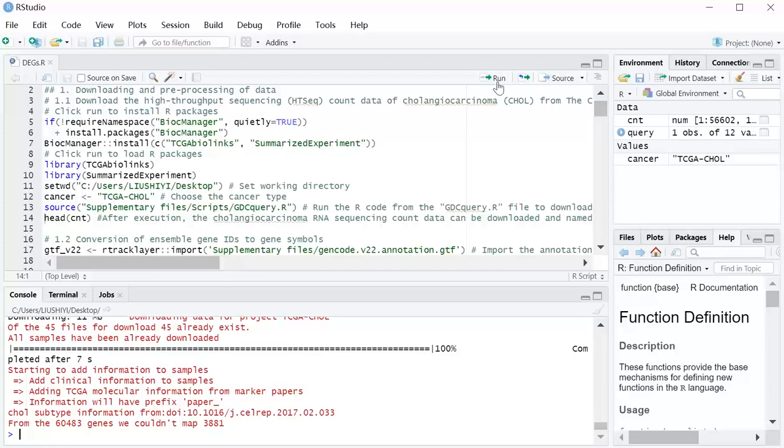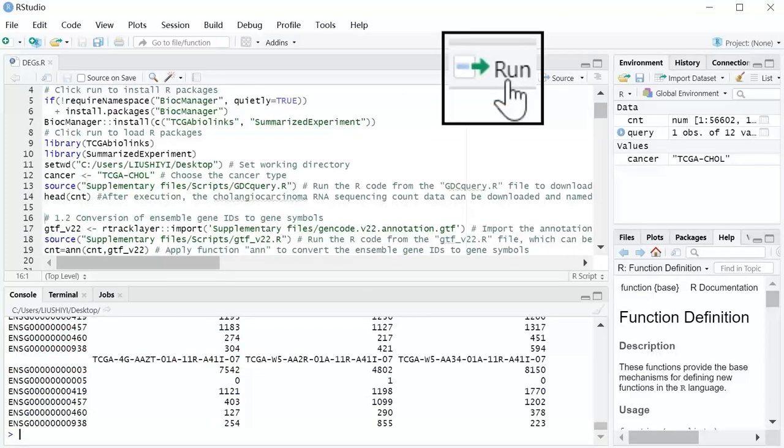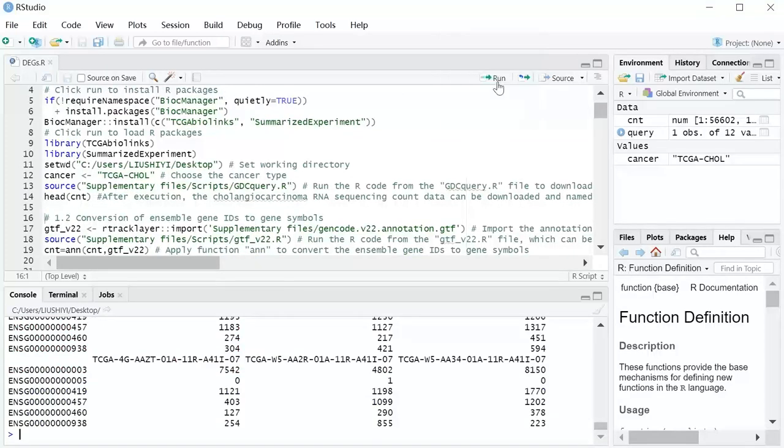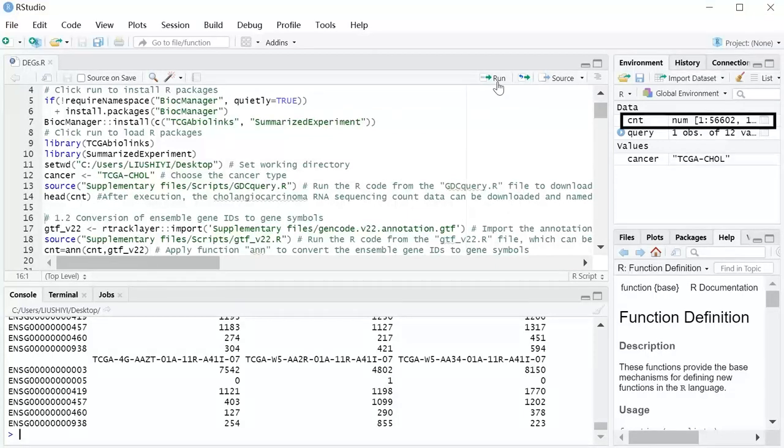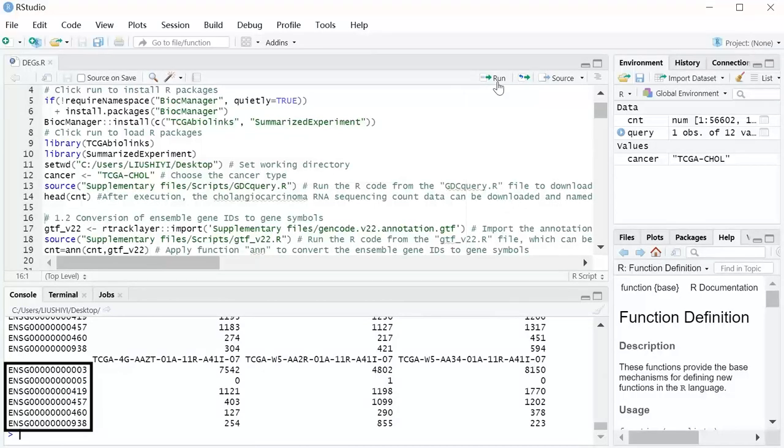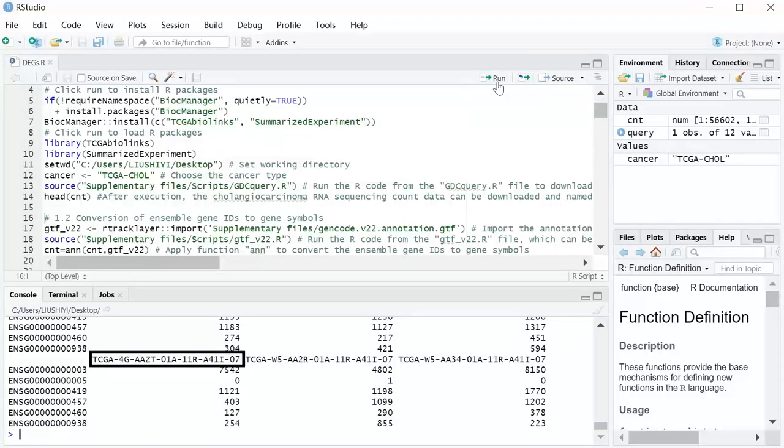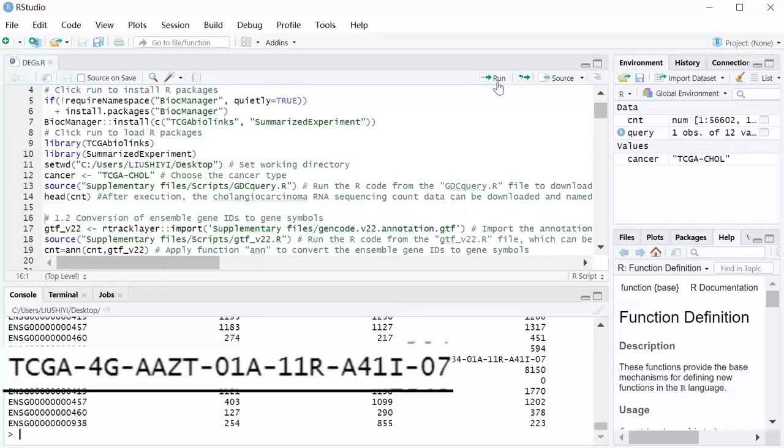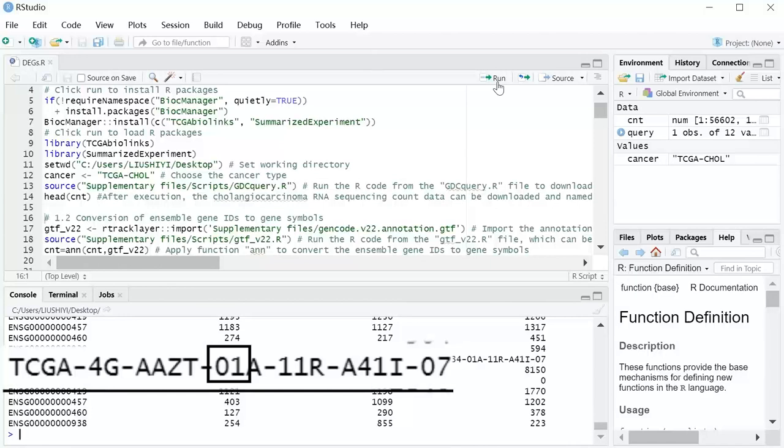After execution, the cholangiocarcinoma RNA sequencing count data can be downloaded and named CNT, where rows represent Ensemble gene IDs and columns represent sample IDs. Please notice the numbers at positions 14 to 15 in the sample IDs. Numbers ranging from 01 to 09 indicate tumors, and 10 to 19 indicate normal tissues.